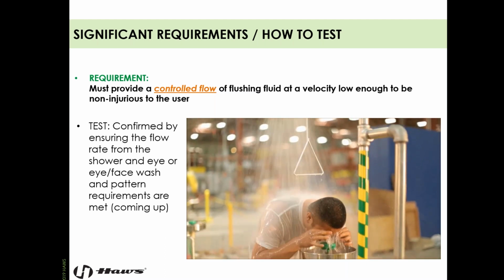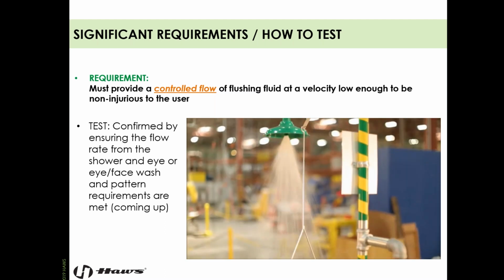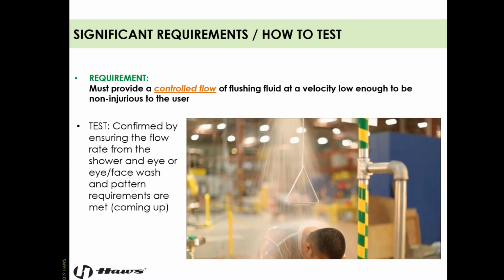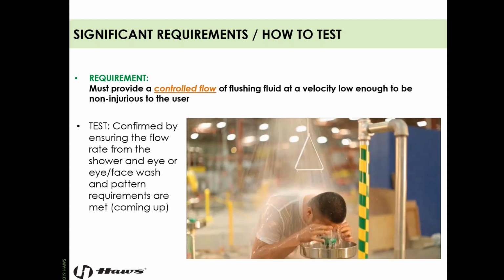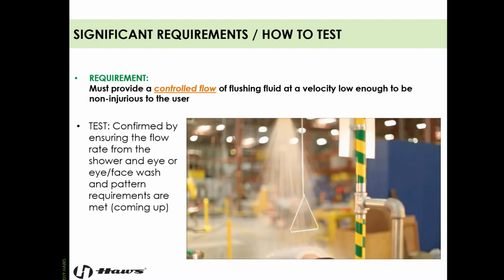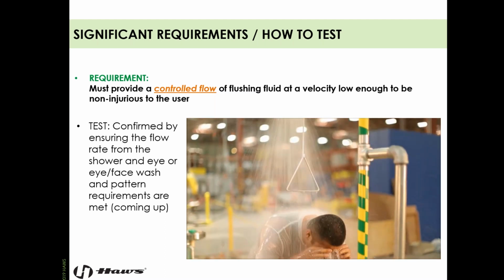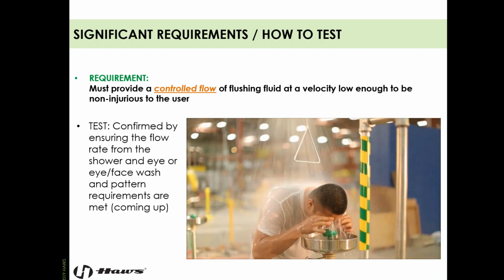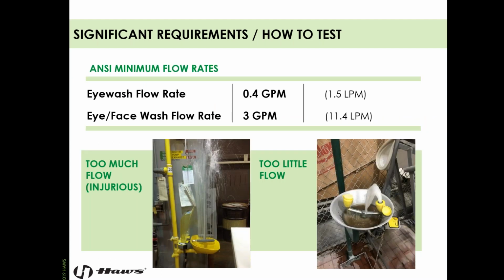If you've never been in a piece of emergency equipment, a combo shower, eyewash shower, no matter what, it's going to be a pretty uncomfortable experience because it's going to be one of the worst times of your life. You've been exposed to something really nasty. We don't need to add insult to injury or make it more difficult to be inside of this equipment for a full 15 minutes. So we want a gentle, controlled flow. So just confirm this by ensuring that the flow rate from the shower, the eyewash, eye/face wash, and the pattern requirements are met, and I'll show you how to do that.